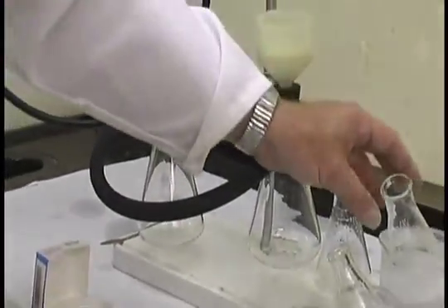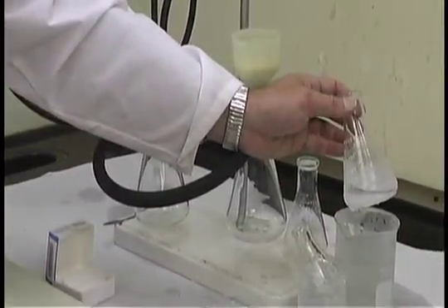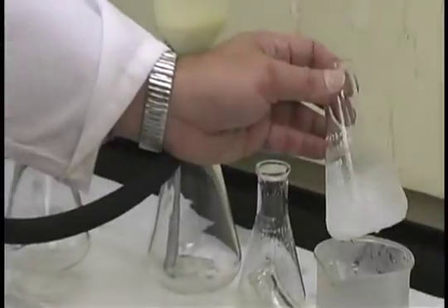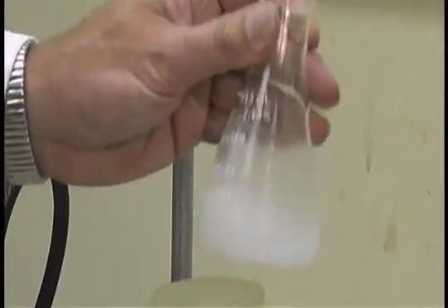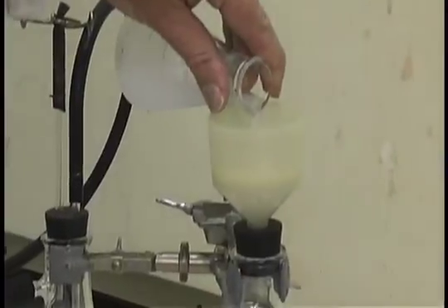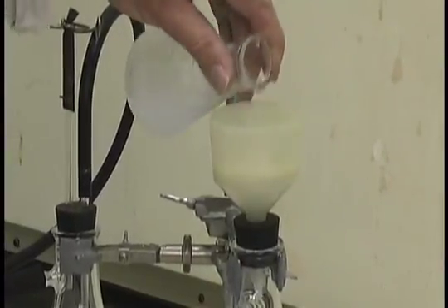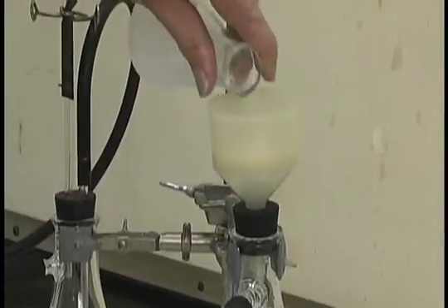We can now add our solution of the recrystallized solute. This solute has typically been cooled in an ice bath for five to ten minutes. Swirl the flask and then pour the contents into the Buechner funnel. You may have to do this a couple of times.